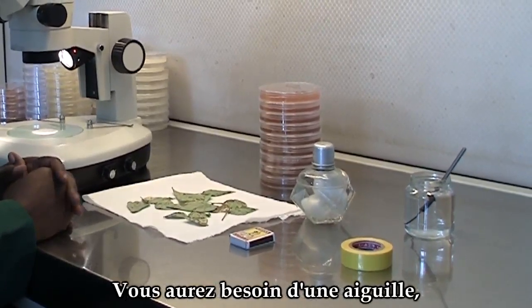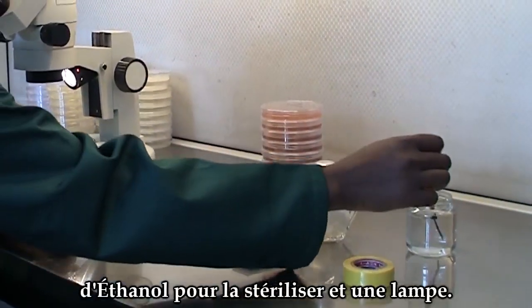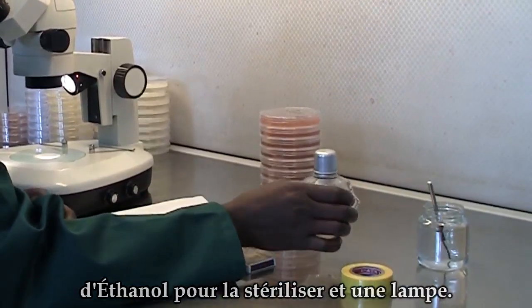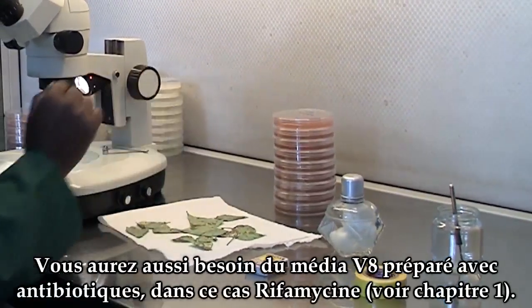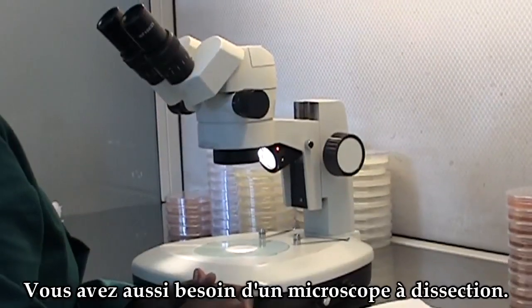You will also need a needle, ethanol to sterilize the needle, and a lamp to sterilize the needle. You will also need V8 media amended with antibiotics — in this case rifamycin. You will also need a microscope.